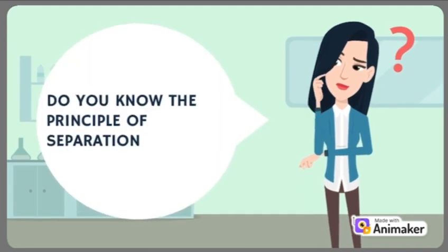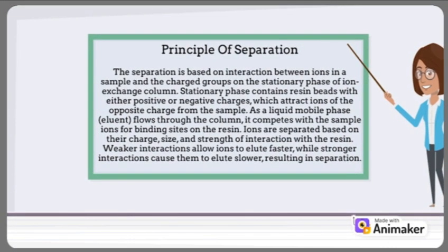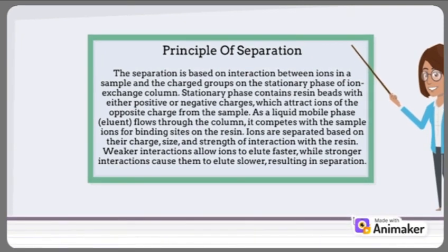What is the principle of separation actually is? In ion chromatography, the interaction between ions in a sample and the charged groups on the stationary phase of an ion exchange column forms the basis of the separation principle.